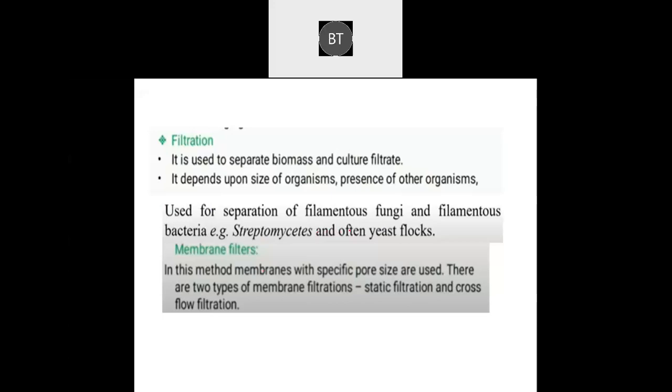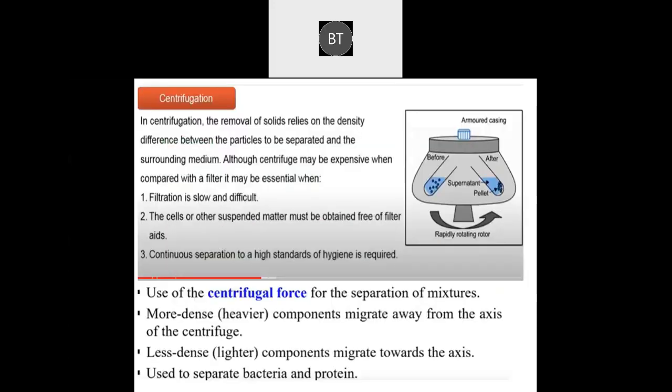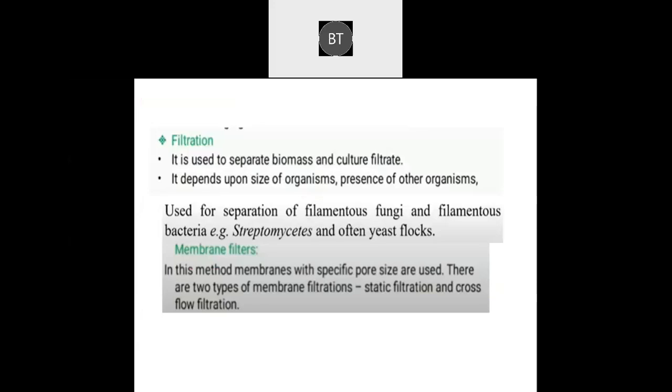In this type of filtration, membranes with specific pore size can be used.